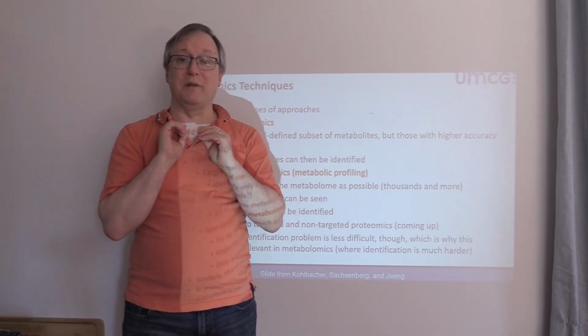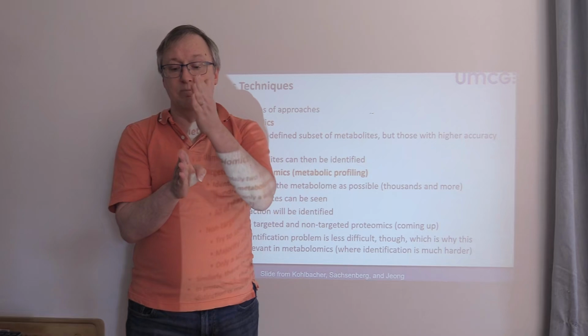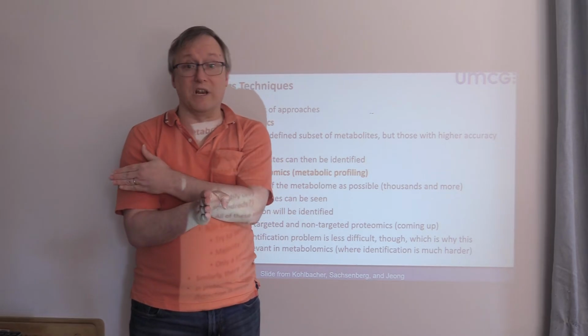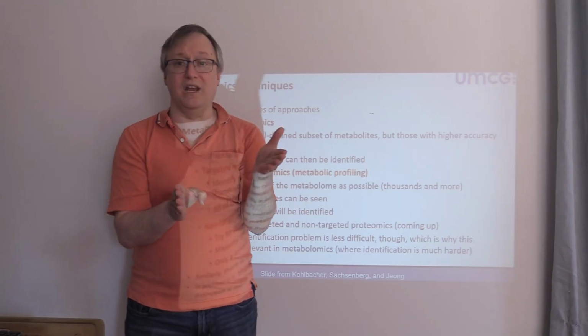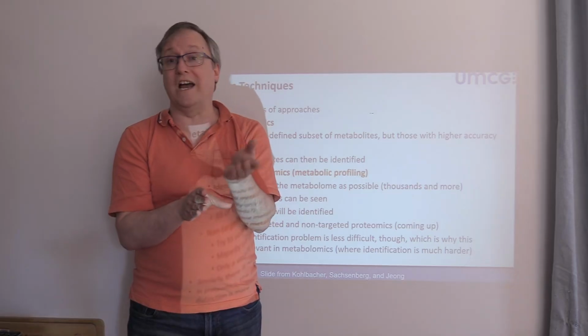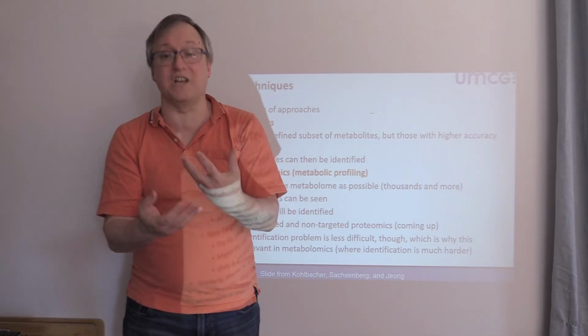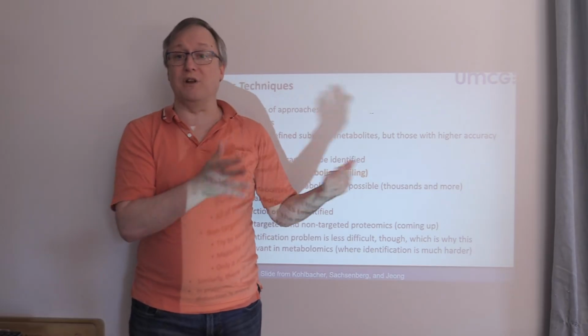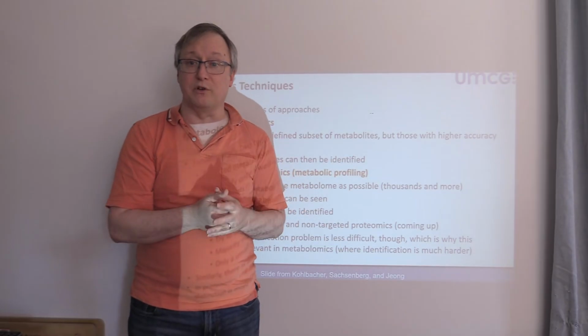So we probably have some very clear notion of how the intact molecule behaves. So we would know things like what its retention time is likely to be in liquid chromatography. We would know what its intact mass should be, what ionic charge states it'll adopt, and probably, if it fragments, what fragment ion mass to charge values should be produced from it.